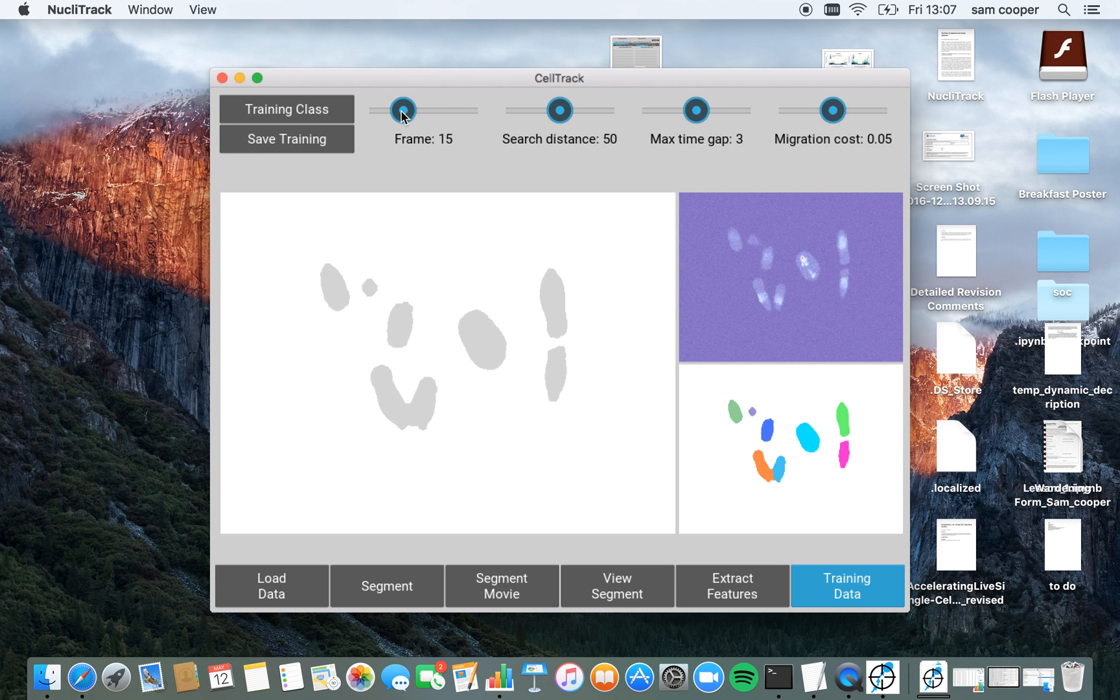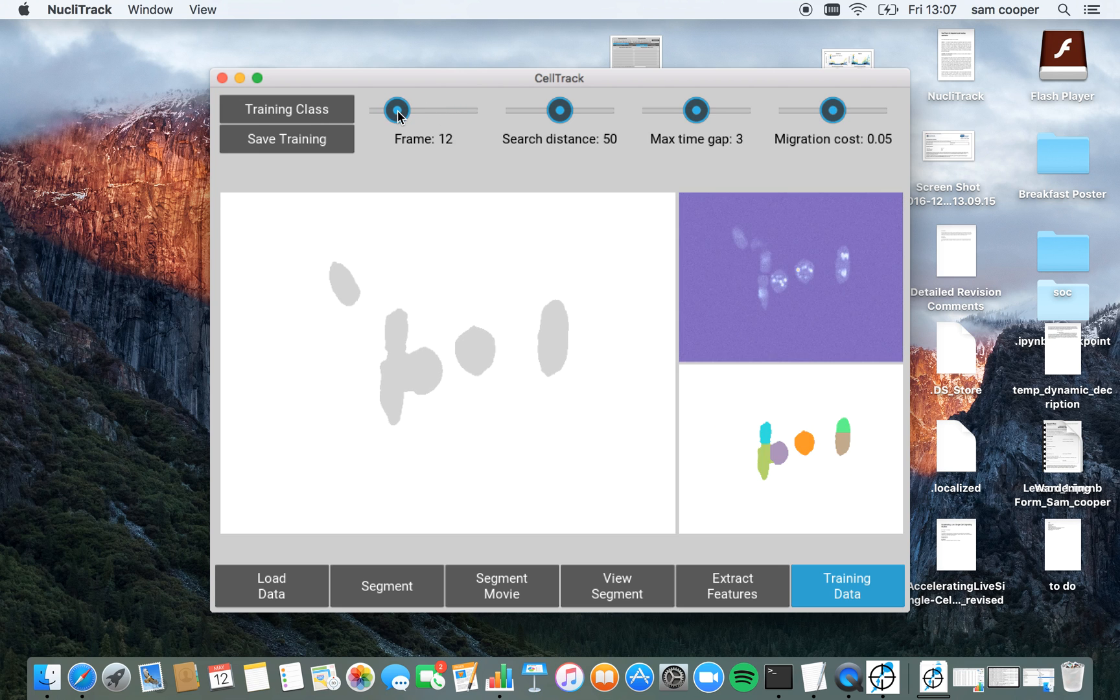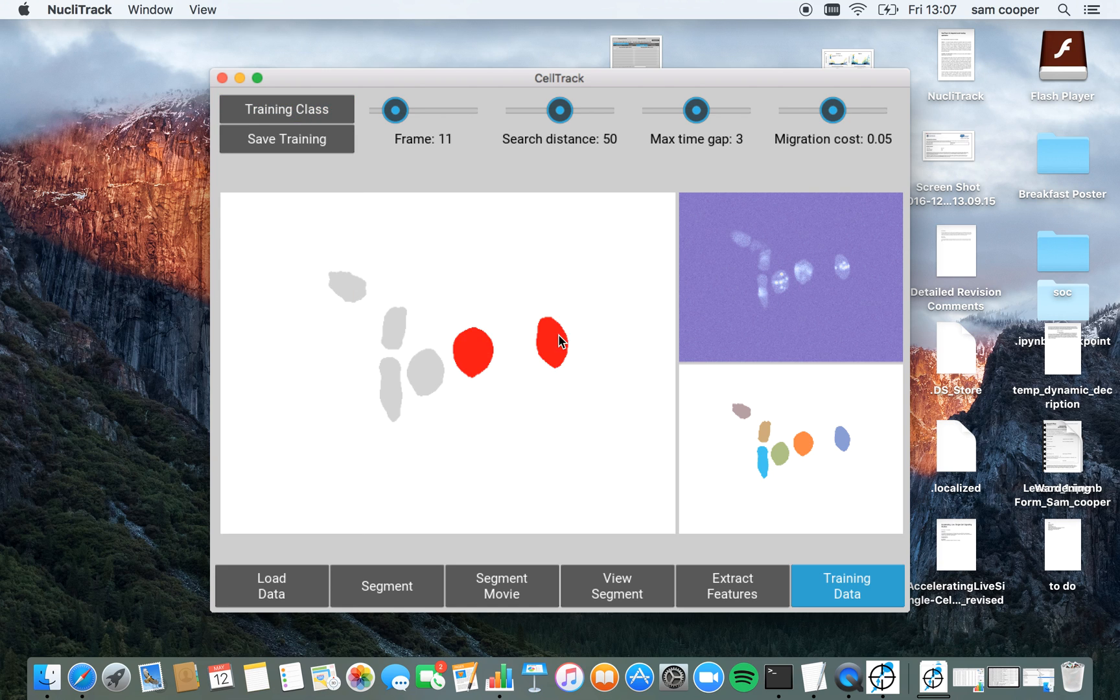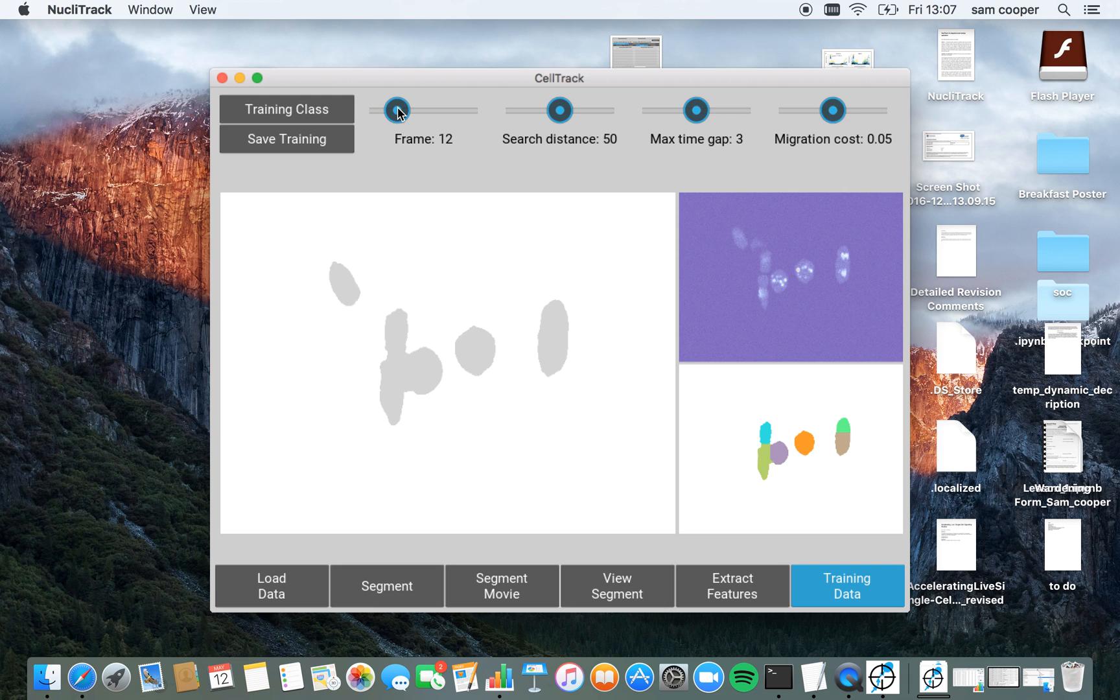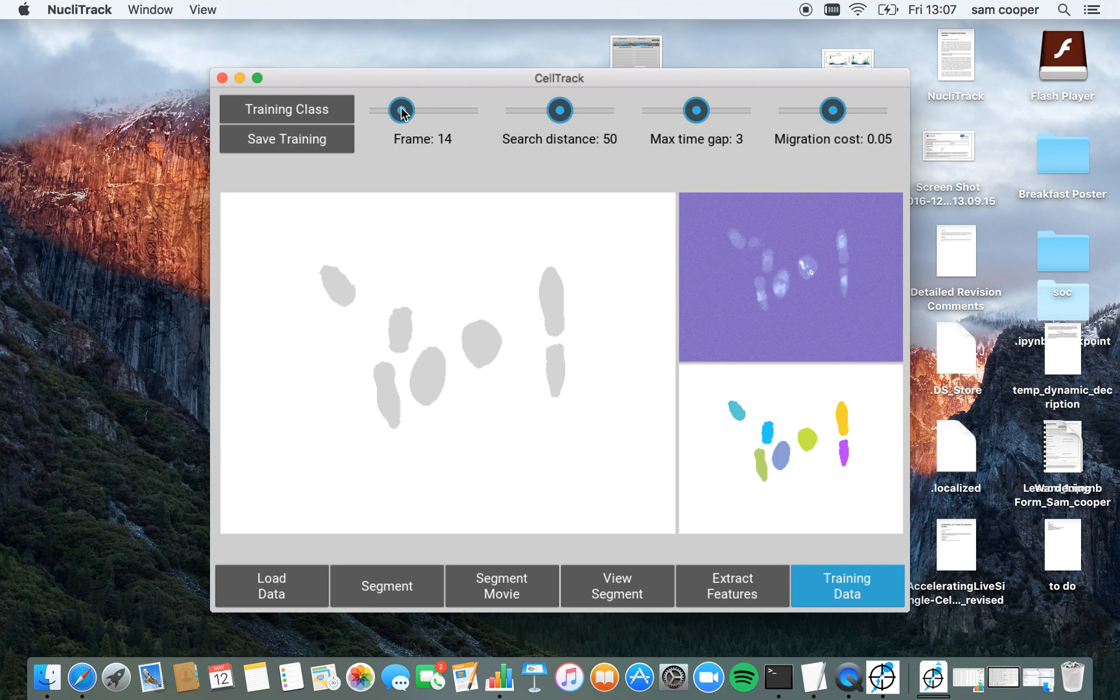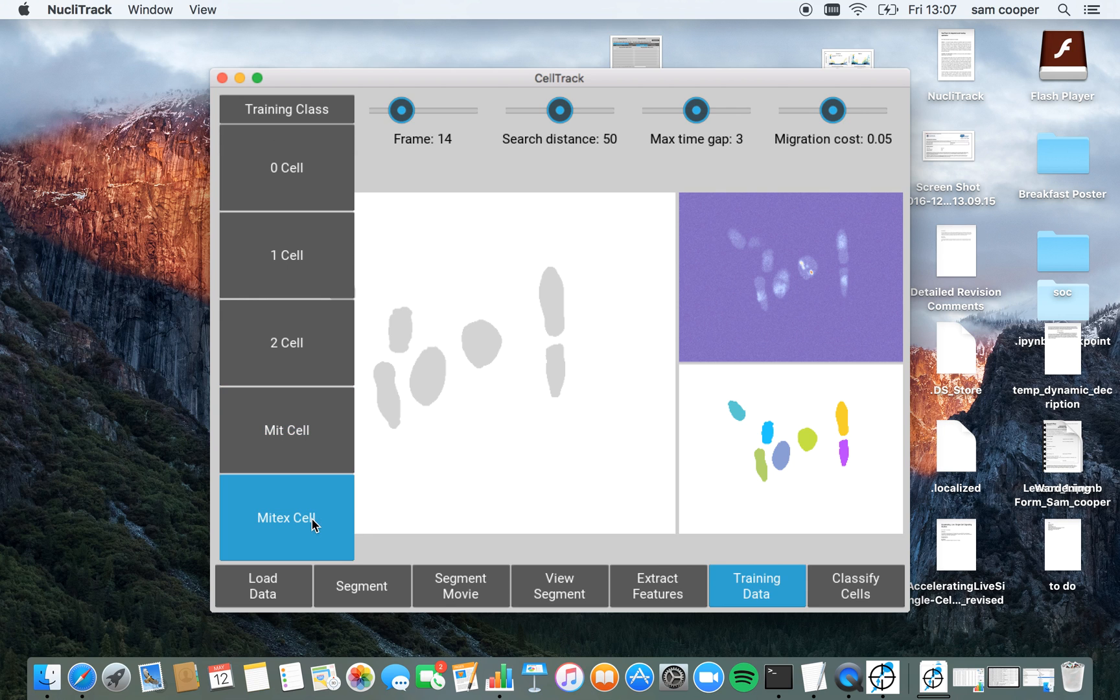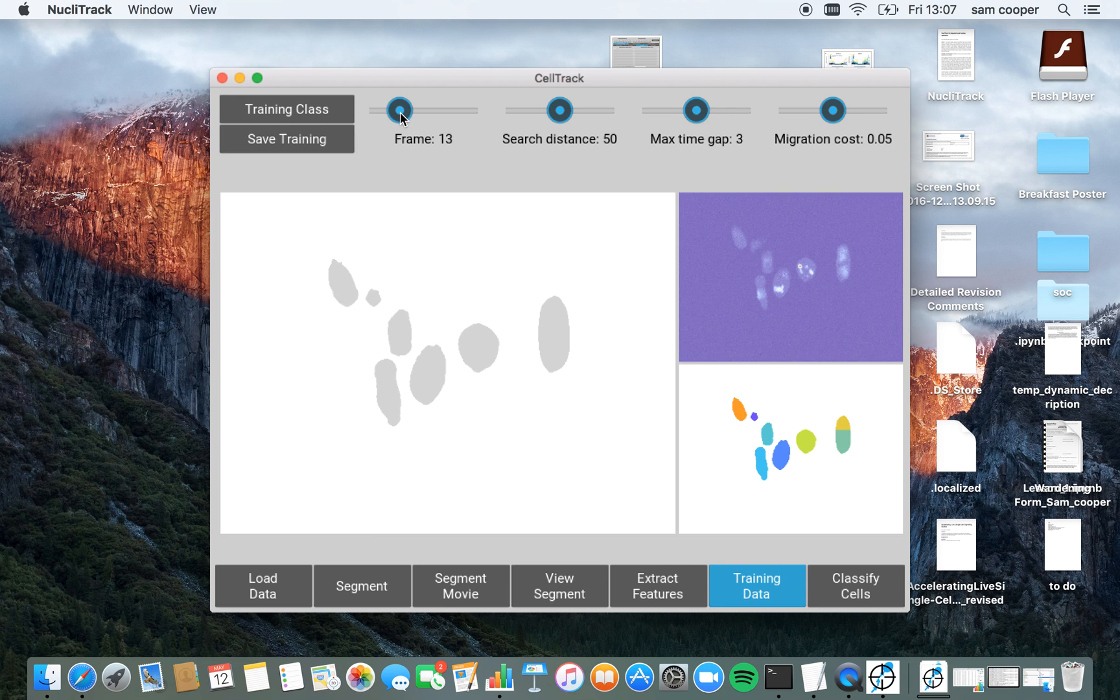However, there are also examples of where a cell is about to undergo mitosis and where a cell is coming out of mitosis. So these two cells here are on their way to mitosis and these two cells are exiting mitosis.